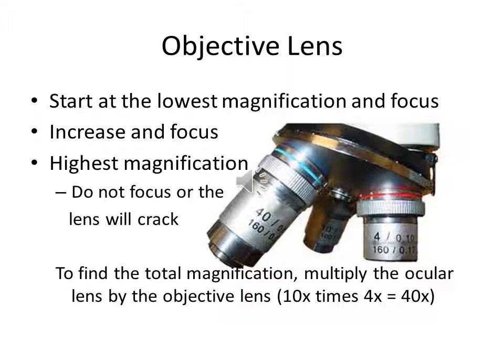So you should always be very clear whether you're dealing with 40 times total magnification, like we see in this example with 10 times ocular and 4 times objective, or are we talking about the 40 times objective and we still have the 10 times ocular for 400 times total mag? So just be careful whether you're saying 40 times objective mag or 40 times total magnification.